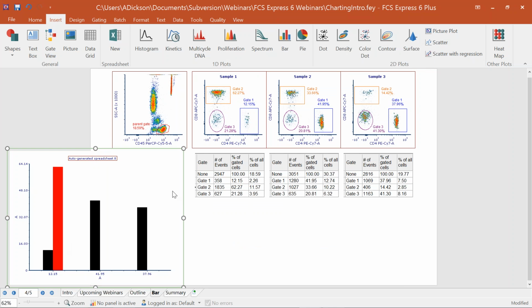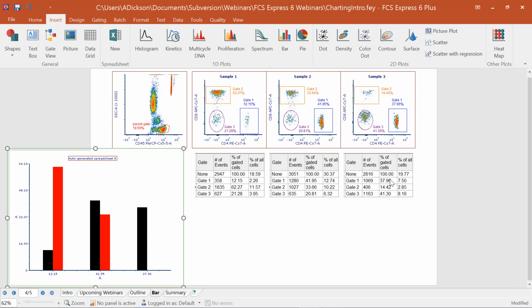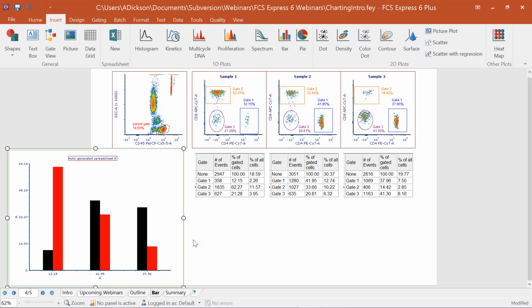Here we have our new series. I'll do the same thing for the next ones. This time I'll actually use the statistics tables. So I'm just going to click and drag that token of interest, and now I have a placeholder where I can drop it for the remaining two subsets. So I'll just do that over here for my third sample, and now I have it.